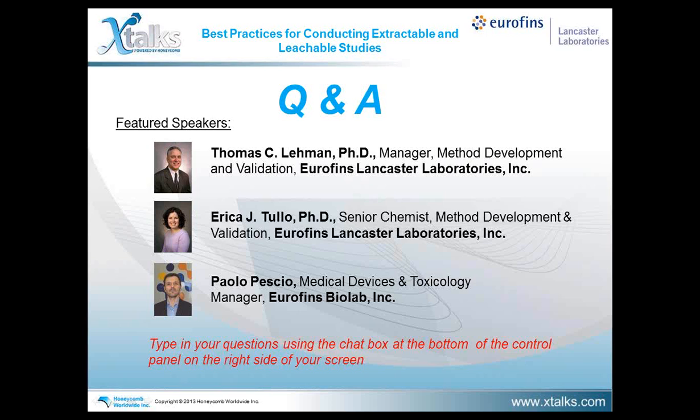I wouldn't necessarily say it's that the extraction conditions were incorrect. We have to remember we're doing very, very vigorous extractions. I could envision two scenarios where leachables may not be extractables. In one, perhaps you extract so vigorously that you break down certain additives, and in the extractable study you're observing the degradants of those additives, whereas in the leachable study under normal use conditions they may not break down, and you would be monitoring the parent additive.